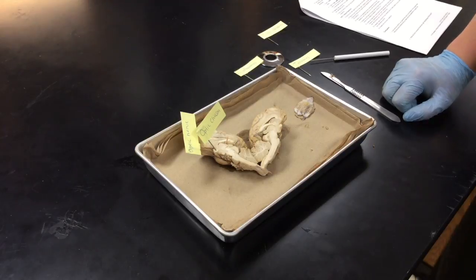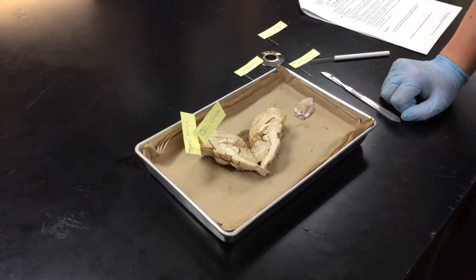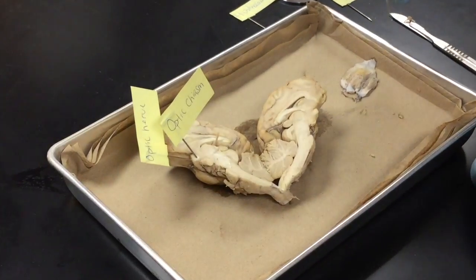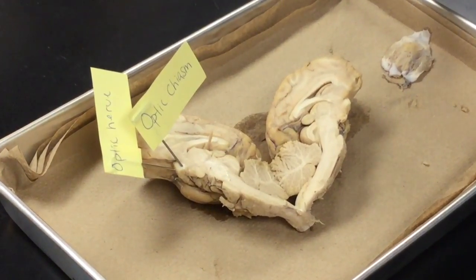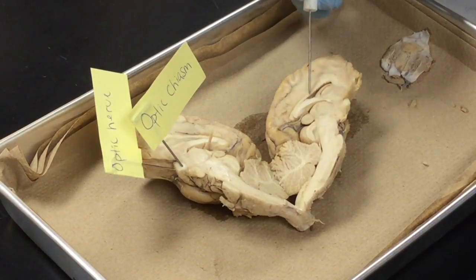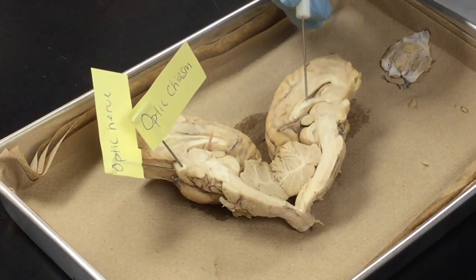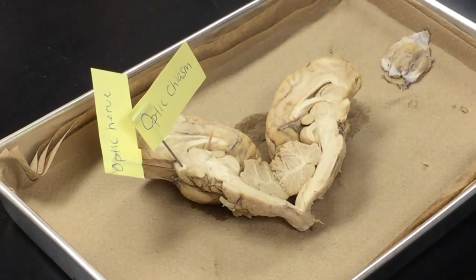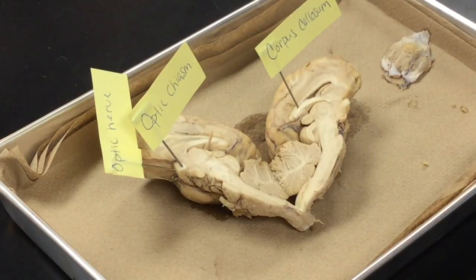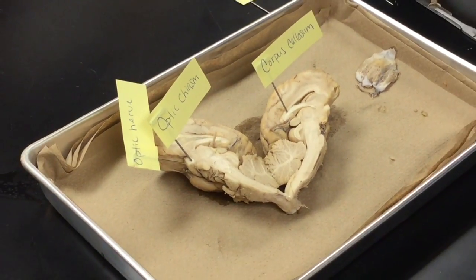All right, we're going to go ahead and identify the last three main parts of the brain for this particular dissection. That's going to be the corpus callosum, the thalamus, and the hypothalamus. The corpus callosum is going to be the region that connects the brain, the left and right parts of the brain, and allows for communication between those two individual parts. If you look here, you can see a kind of lighter area that is outlined in the middle part of the brain, and that's what we call the corpus callosum. It's just going to be a bundle of fibers that allows for our left side of our brain to talk to the right side of our brain.